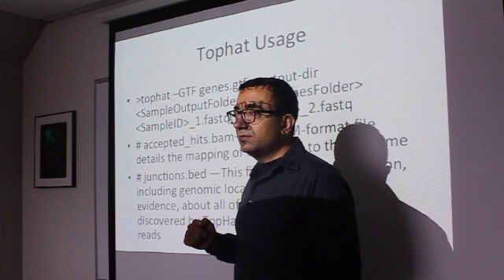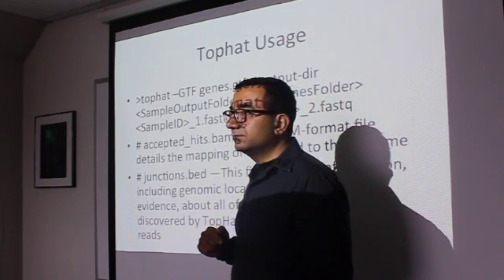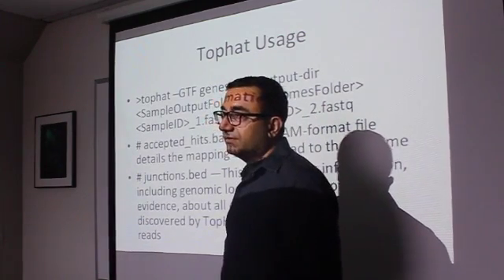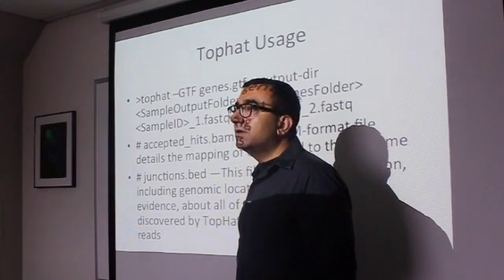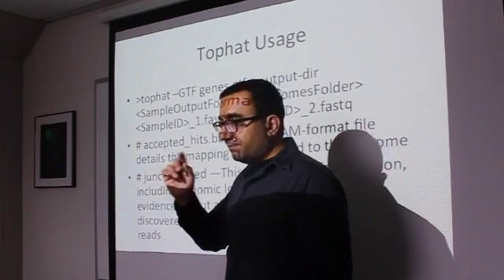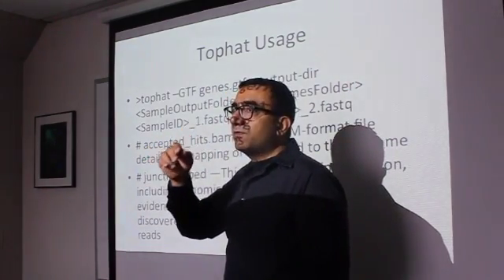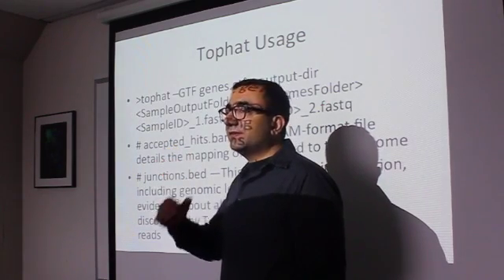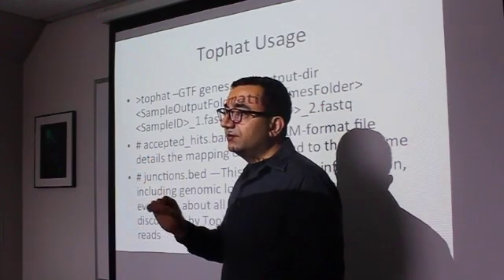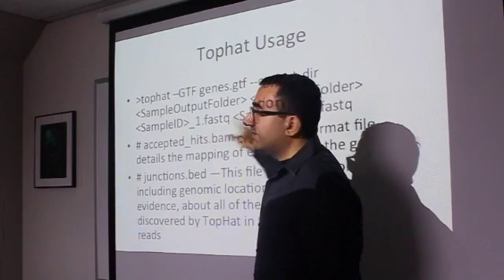Alright? Yes? I seem to remember there being a left paired end and a right. Yeah, so this will be the left and this will be the right. It's the same sample for those two, but one is the left and one is the right. But if you're doing multiple samples in the same command, you put a comma. You can also use a comma when it's the same sample but split over multiple lanes, so it creates a different file. Okay, gotcha. So you can separate them by commas, but otherwise it's left and right paired.